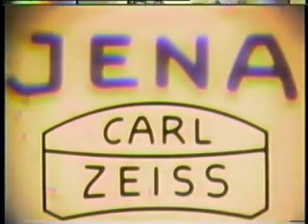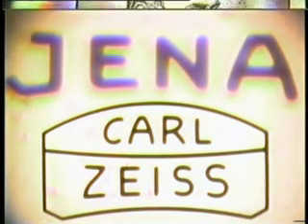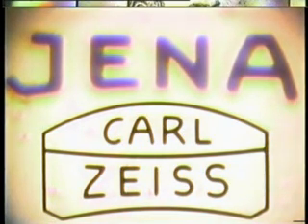Also behind Abbe, since he's in the back focal plane of the objective, you can see the filament of the lamp, which should be imaged there, and you see no sign of the filament of the lamp in the image plane, as Köhler illumination would arrange.